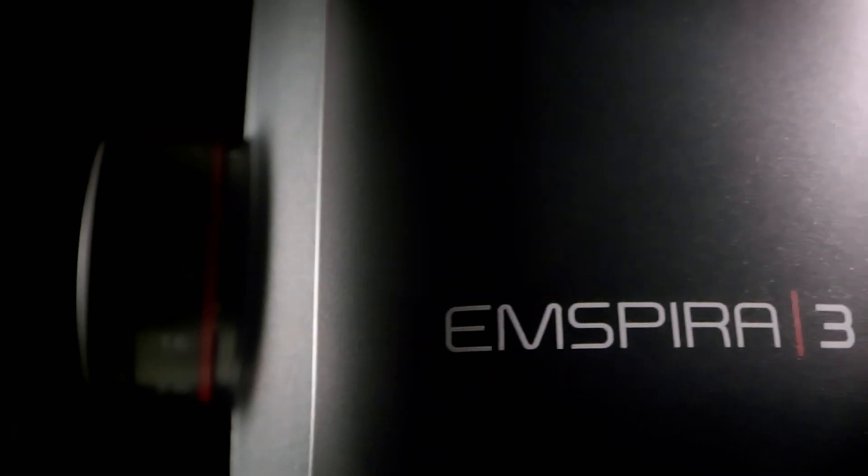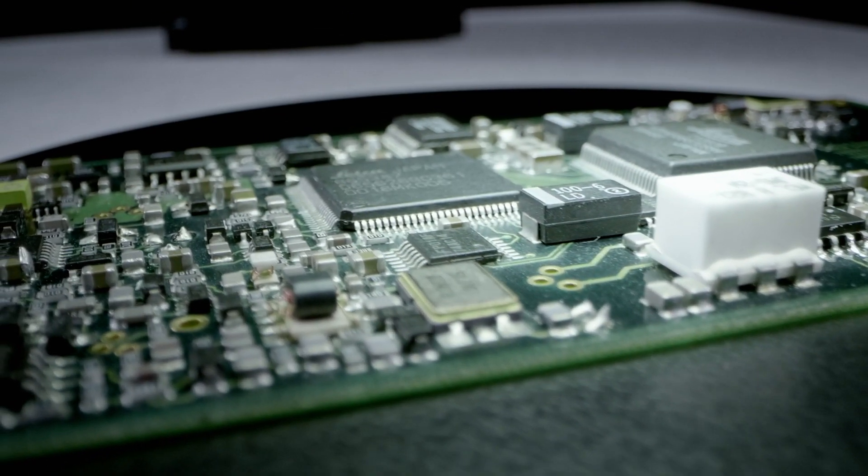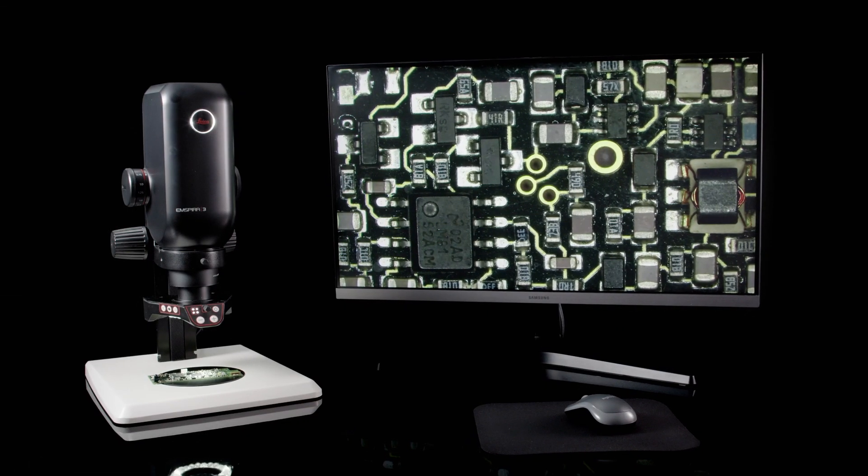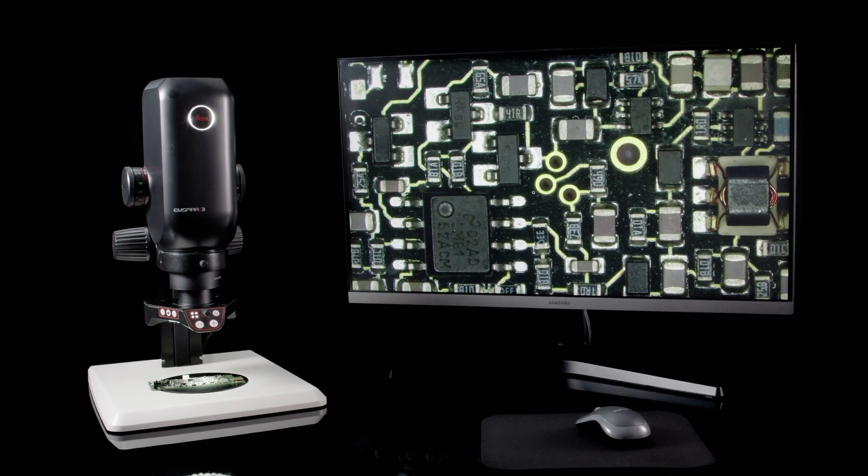Emspira 3 Digital Microscope. Just picture for a moment all you need for a thorough, robust inspection process. Surprised? Yes, it's just this.